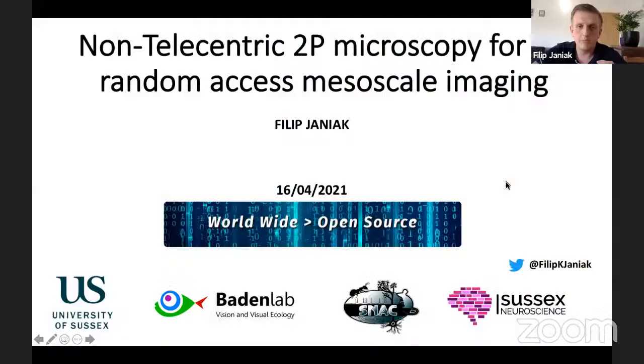Hello, Filip. Thanks for being with us today. Hello, welcome everyone. Thank you, Maxime, for this great introduction. It's a great pleasure for me to be here today. And yes, today I want to show you my project relating to upgrading of the two-photon scanning microscopy for mesoscale imaging.